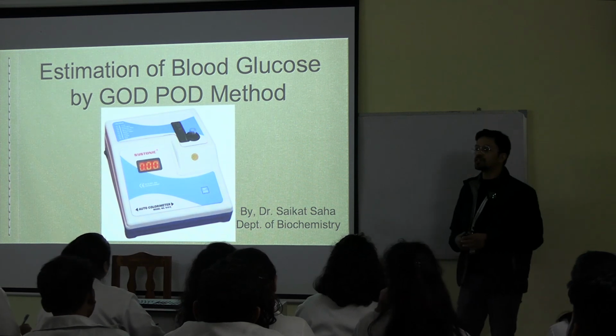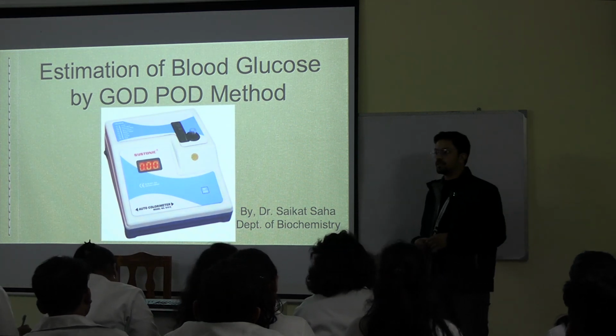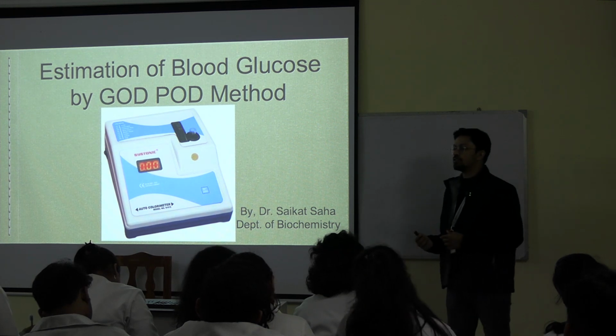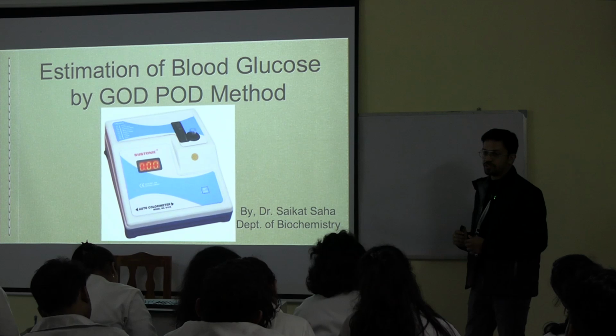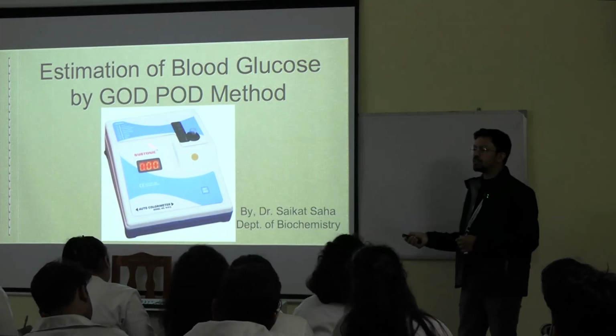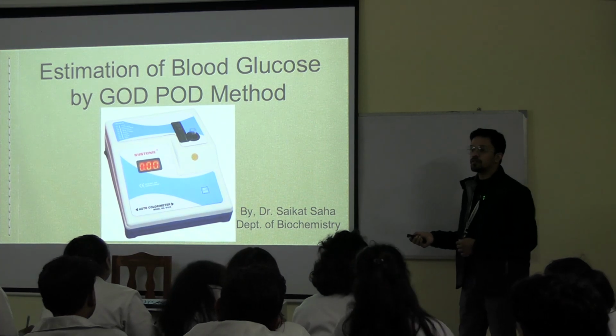The full form of GOD-POD is the glucose oxidase peroxidase method. In short we say GOD-POD, but if the examiner is asking, don't say GOD-POD, say glucose oxidase peroxidase method. Everyone is acquainted with this instrument. Name of the instrument? Colorimeter.